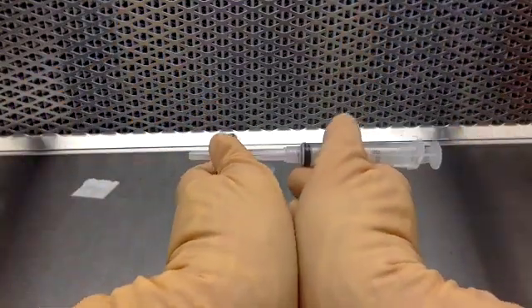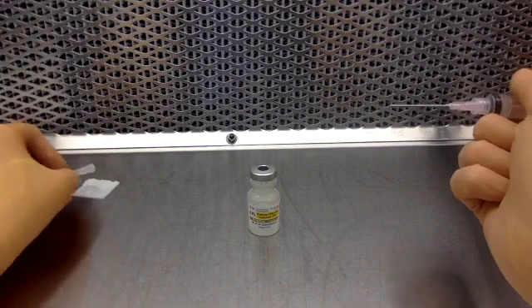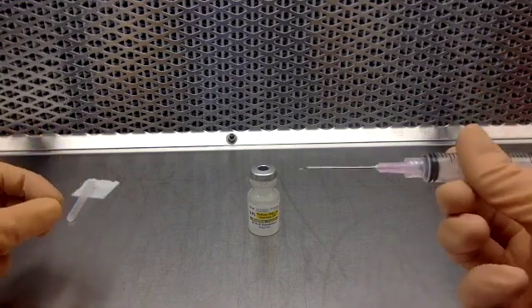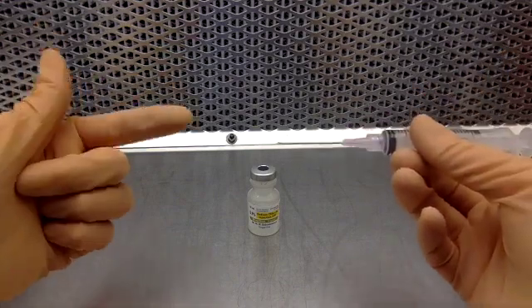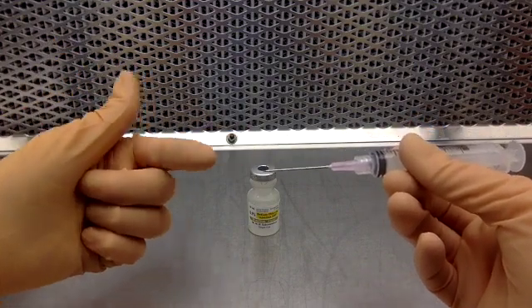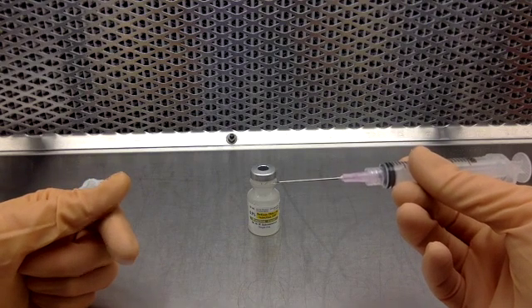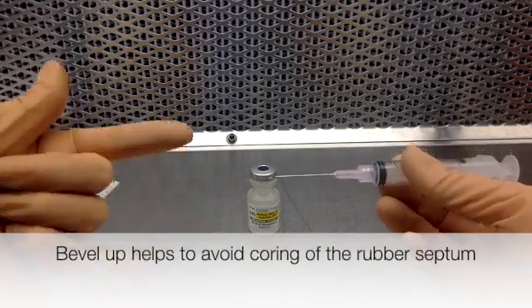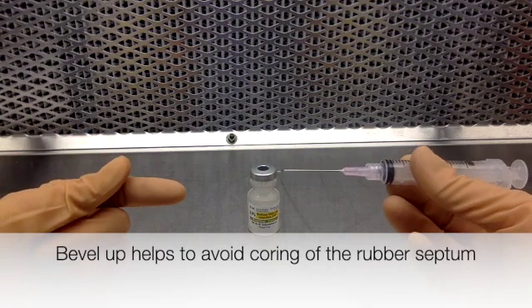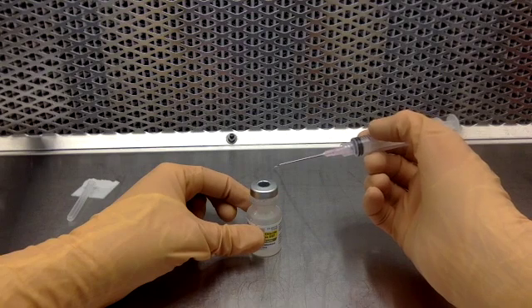Using the wrist-to-wrist method, you're going to uncap. You'll notice on a standard 18 gauge needle that you have the bevel, that's the slanted area. You have your heel, the tip, and the bevel. When you're going into a vial, you want it to be bevel up, which means it's facing the ceiling of your PEC, and you go from a 45 to a 90 degree angle.